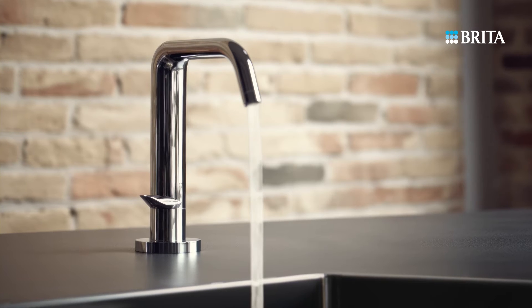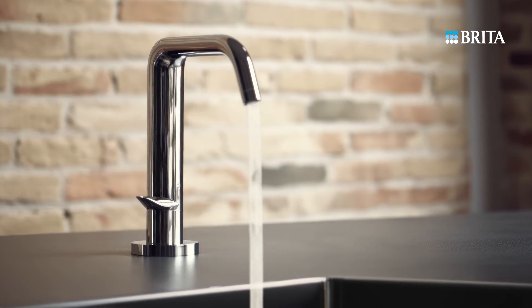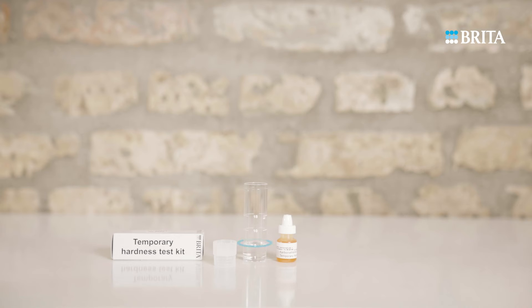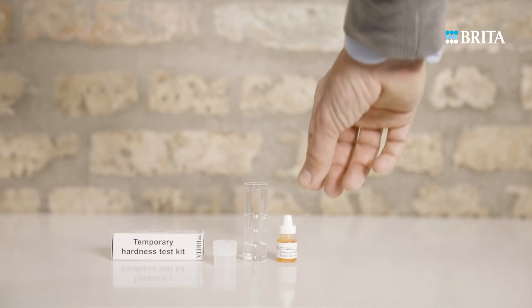To obtain an accurate measurement, open the tap and let the water flow until it is cold. Fill the vial with it up to the 5 ml mark.